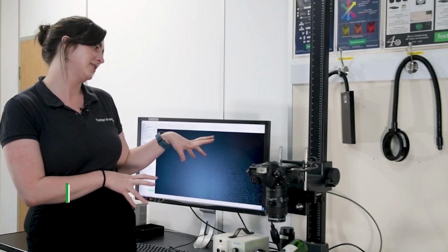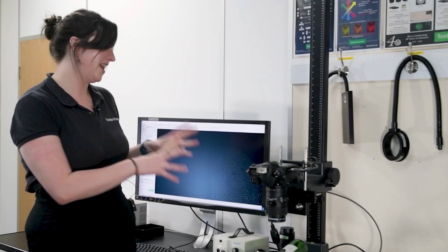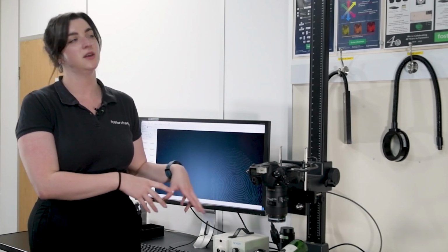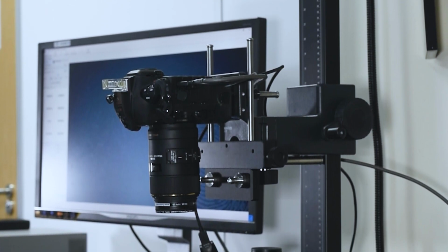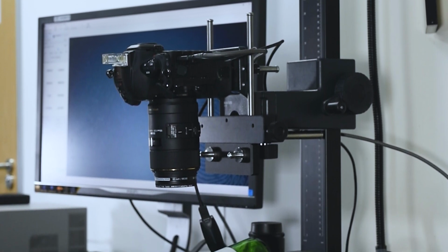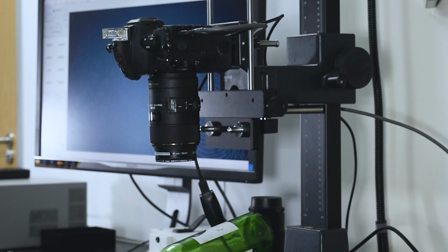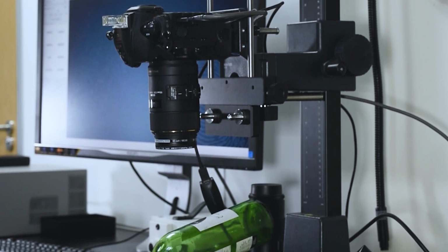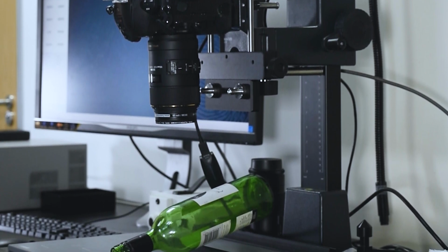So let's take a look at some examples. Throughout this webinar, we're probably going to focus our demos primarily around the DCS. That's because if a finger mark is challenging, we're going to need the best of the best to be able to photograph this. So the DCS itself is made up of specialist lighting attachments, a high-resolution camera, and specially designed fingerprint enhancement software that all work together cohesively to mean that we are able to photograph any fingerprint on any background. And that really is why we use the DCS5 when it comes to challenging finger marks. That's what all of us go straight to.